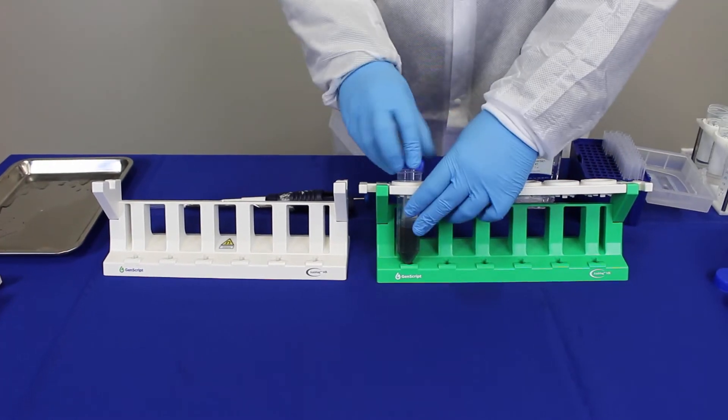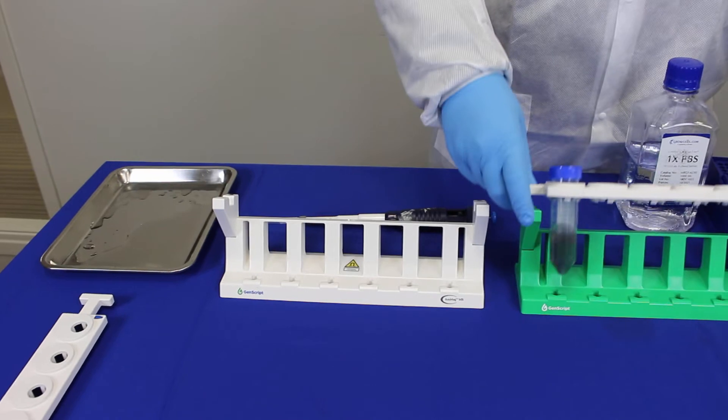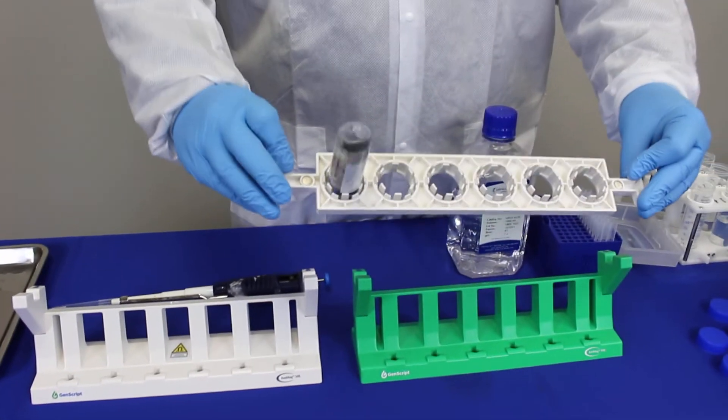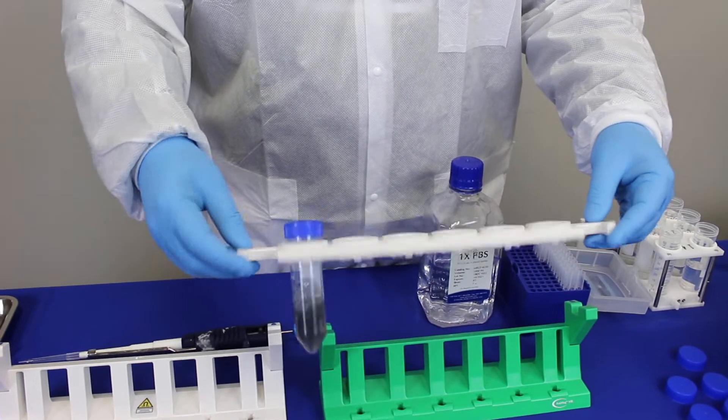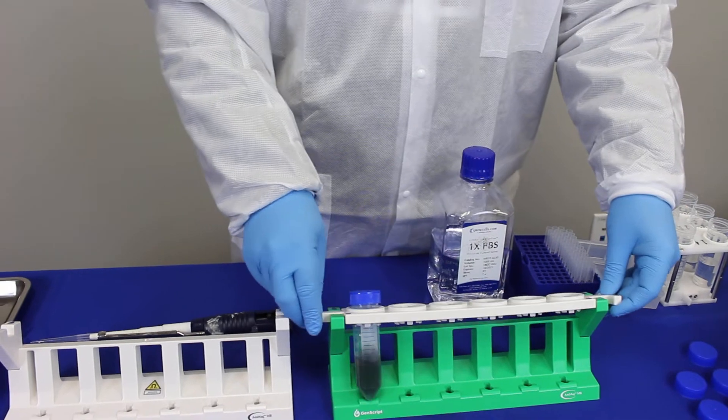You just cap the tube, lift this part of the rack, and then shake it to make sure that all the beads are resuspended, and so that the ethanol is mixed with the PBS.